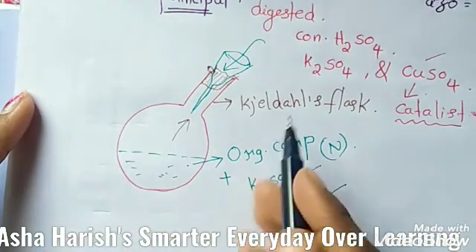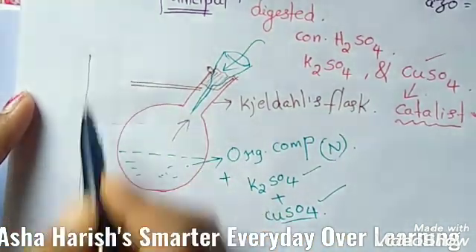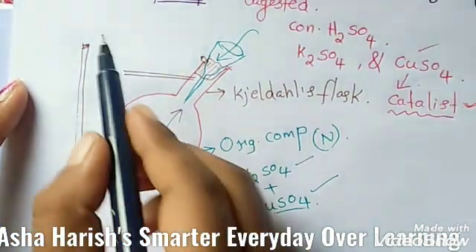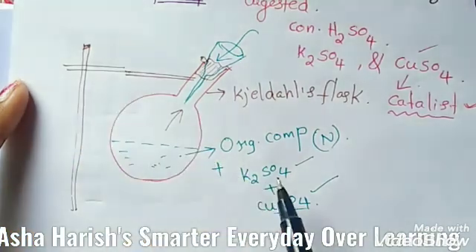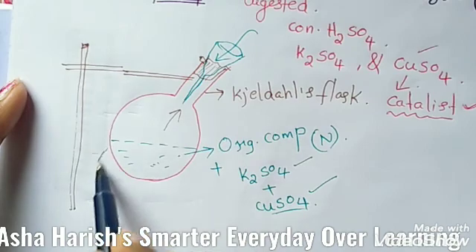And students, this complete apparatus you need to fix to a stand.